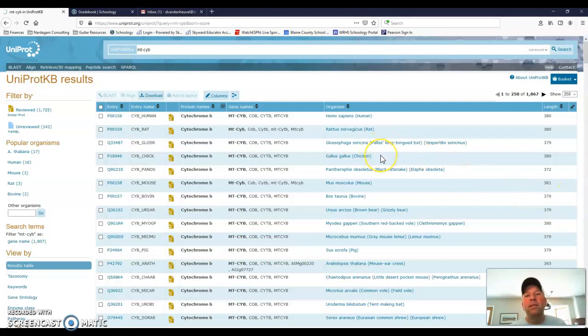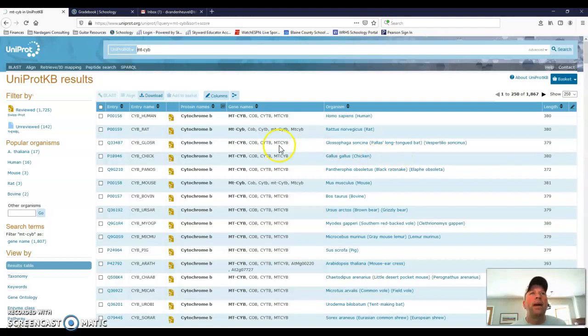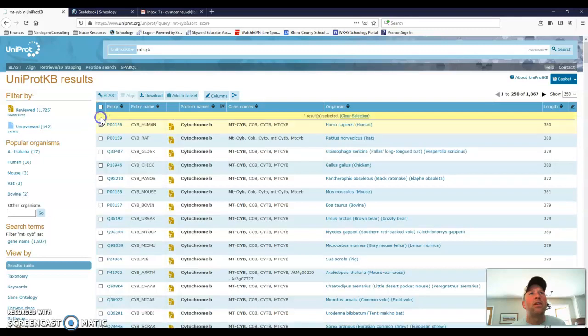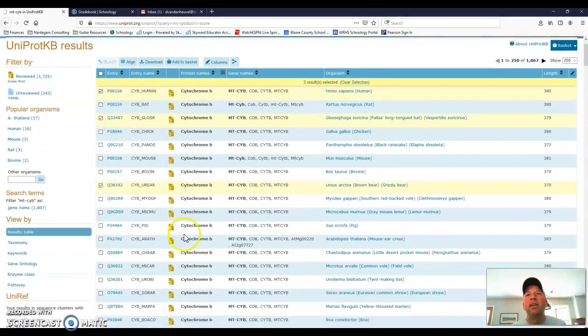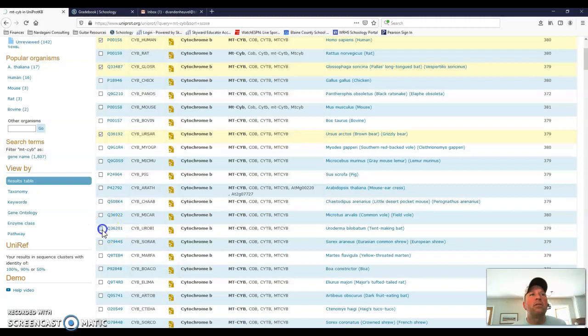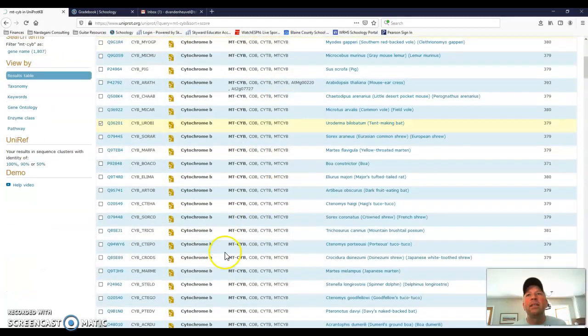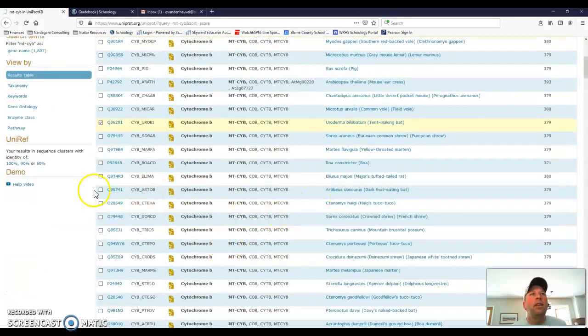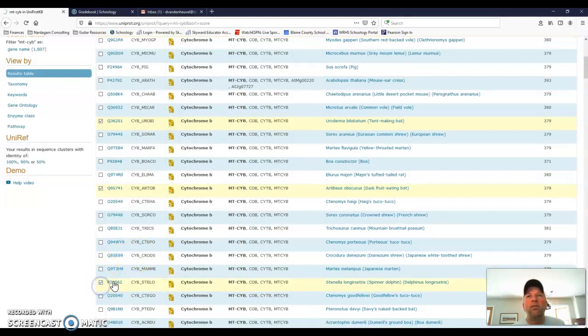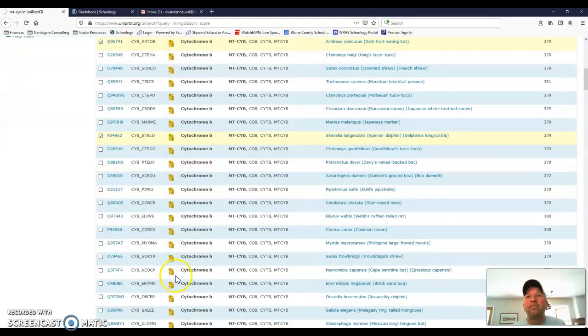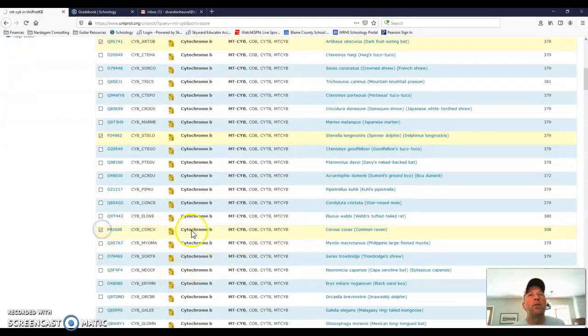And now I can choose species. So if I'm comparing bats and birds and mammals, I need to choose some bats, some birds, and some mammals and put them into my basket. So I can just scroll down the list and start checking things. So here's human. That's a mammal. Grizzly bear. Great. Here's a bat. Palace's long-tongued bat. I'm going to check that one. Just going down. Here's another bat. Fruit-eating bat. Great. Again, looking for some mammals and some birds as well. I might choose, here's a dolphin. Here's a common raven. There's a bird.